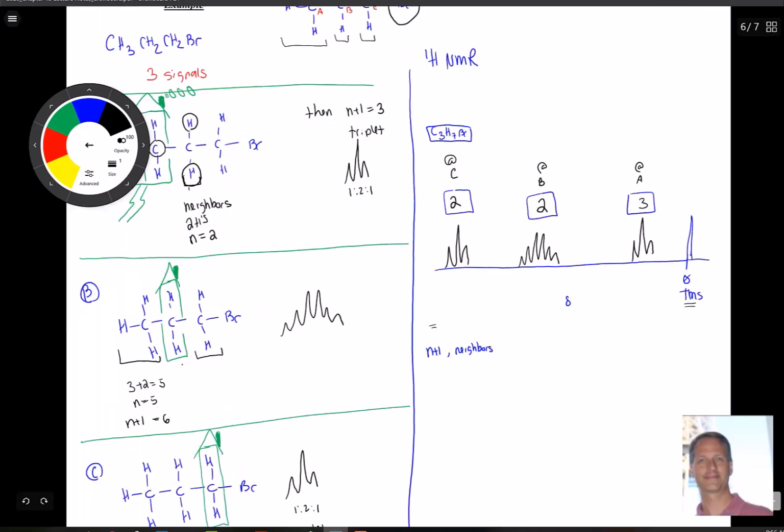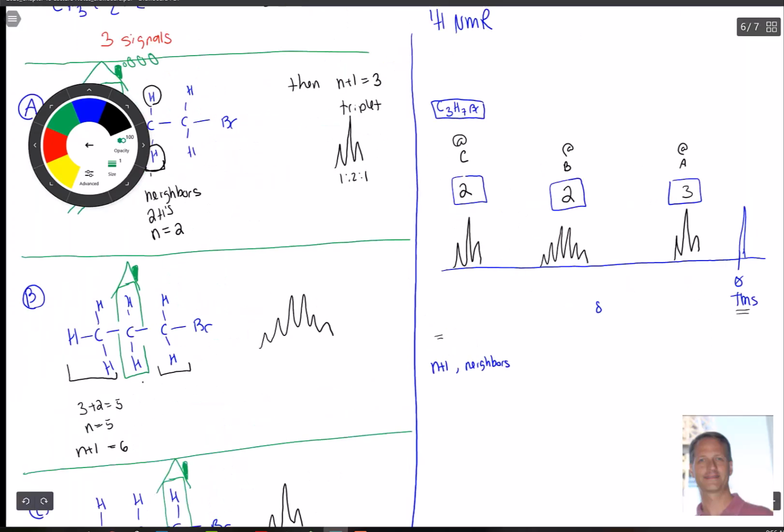So together, I want to put this in our notes right now. This number is what we call integration. It tells us what belongs to us. In other words, here's another way of thinking of it: it's what's inside of our house. So what's inside of our house is here. And this peak pattern right here tells us basically what we're next to.